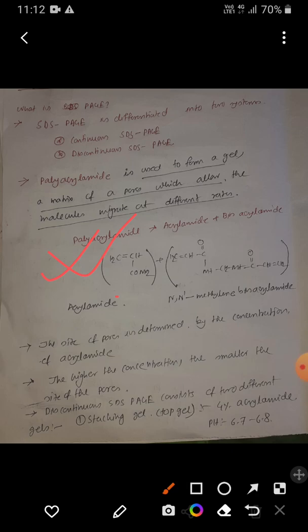We have discussed that we use polyacrylamide gel for protein separation, right? Now the question is why. We can use agarose gel also, but why polyacrylamide? The answer is that protein is relatively smaller than nucleic acid, because nucleic acid is an extended structure while a protein is relatively compact. Polyacrylamide gel forms a matrix whose pore size is relatively lower than the pore size created by agarose.